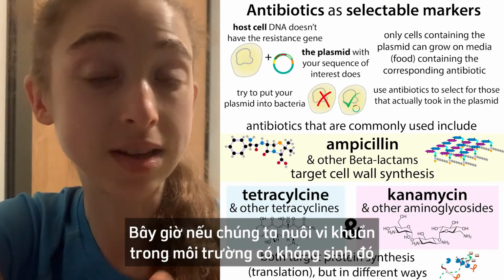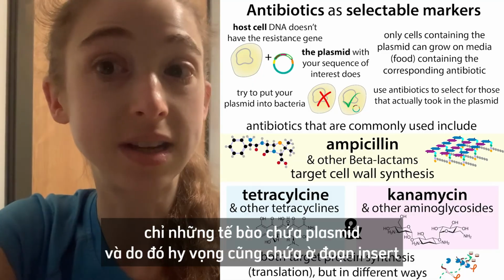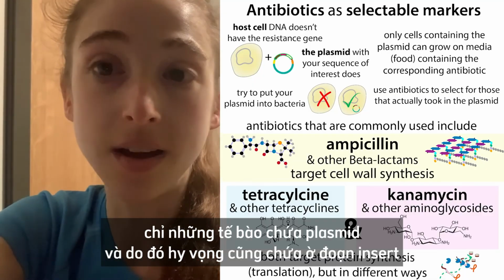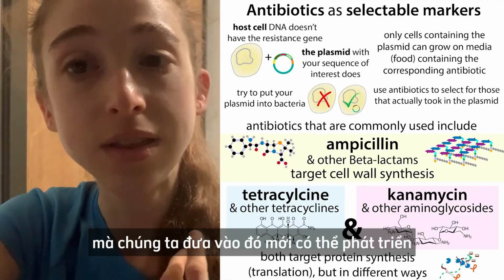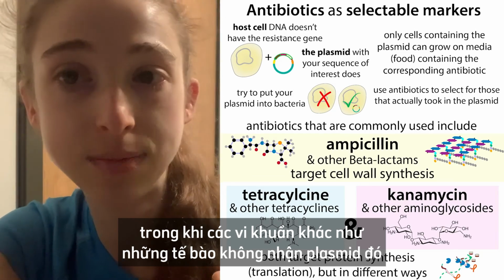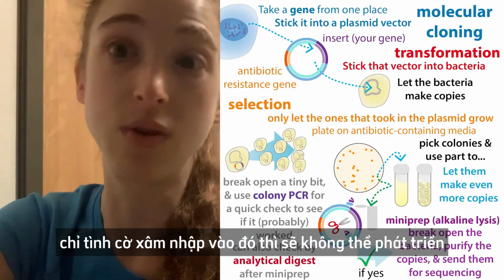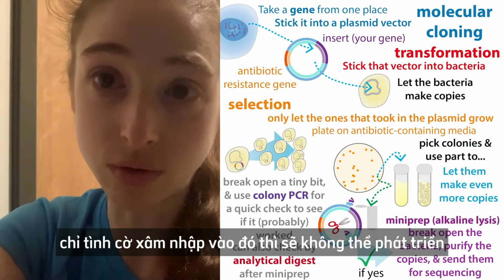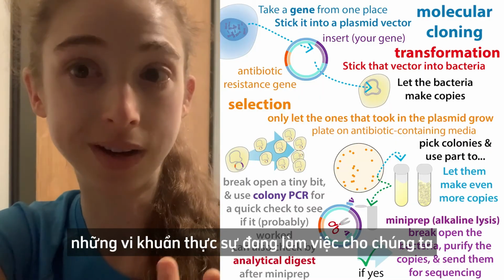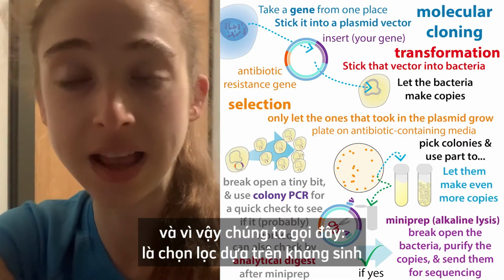Now, if we grow the bacteria in the presence of that antibiotic, only the cells that contain the plasmid, and therefore hopefully also contain the insert that we put in there, will be able to grow. Other bacteria, such as cells that didn't take in that plasmid, and other bacteria that just wandered in there, won't be able to grow. This way, we're only feeding those bacteria that are actually working for us. We call this antibiotic-based selection.